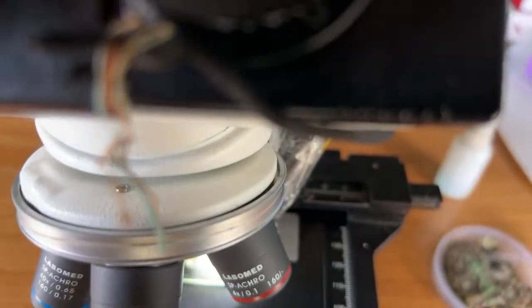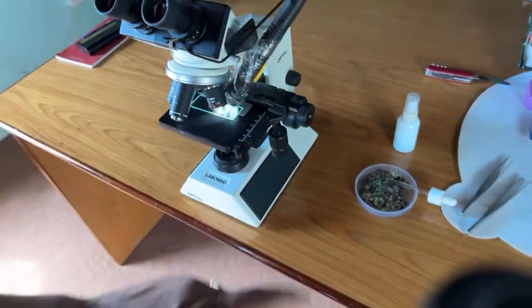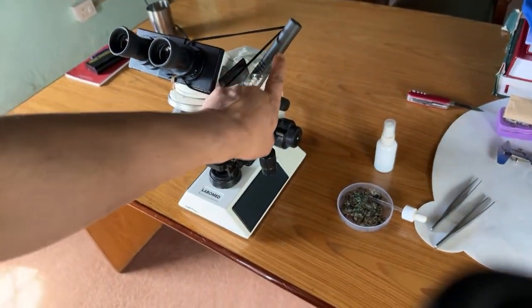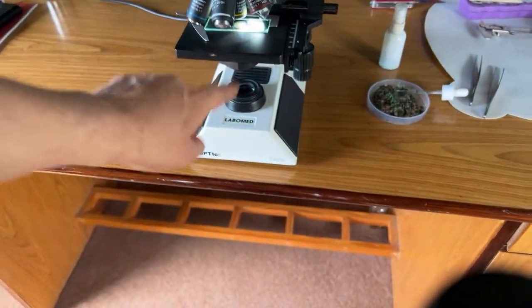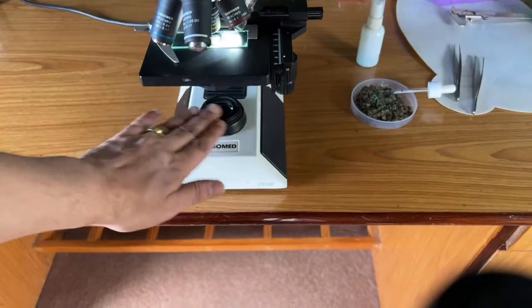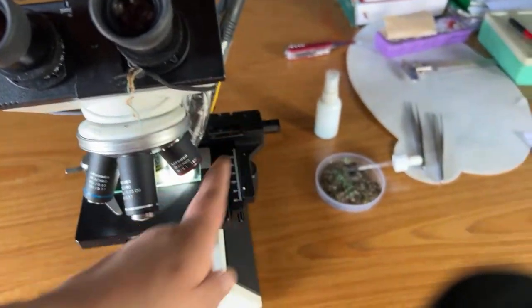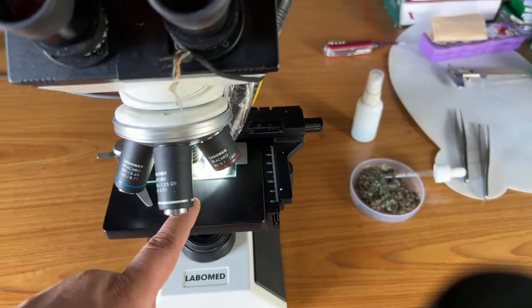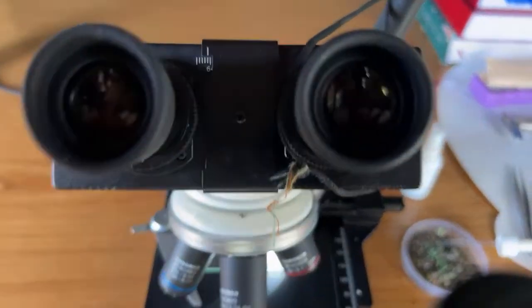All right. So once again, what I've done here is attach an LED torch which is throwing the light at an oblique angle. The original light source of the microscope has been cut off so as to allow the light to fall on the sample or the object, get reflected through the eyepiece for us to observe, giving us a more realistic picture. So now we put the camera in alignment.